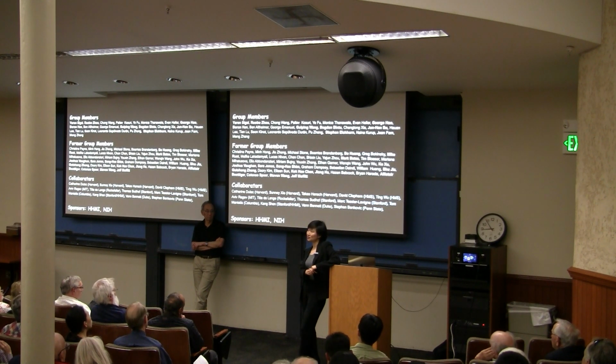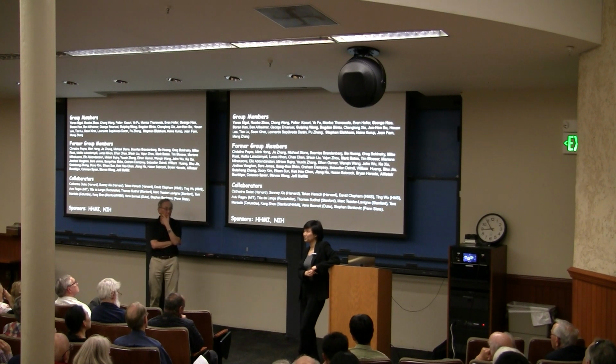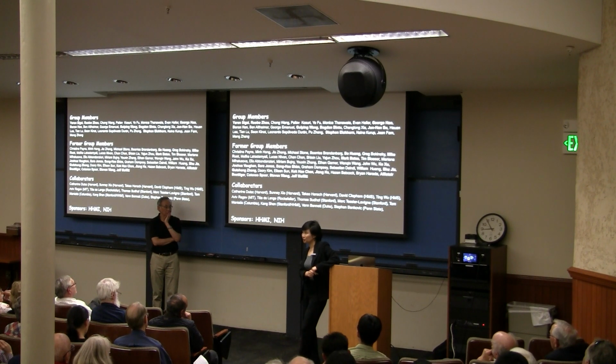I do agree with you that if you want to study deep in tissue, there are additional challenges. And there are a variety of additional challenges that one can think about answering with a variety of different approaches. Now, the first level of challenge comes from aberration. So very often, our imaging system's refractive index does not exactly match the refractive index of the tissue. And then as you go deeper and deeper, or more and more away from the surface, you get stronger and stronger aberration. And these aberrations can actually be corrected by adaptive optics. So that's one way to go.